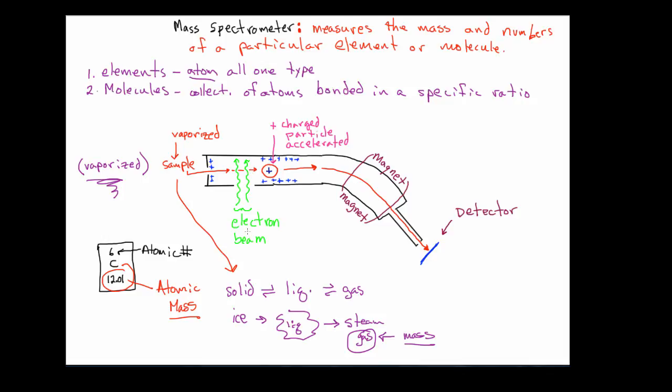All right, now this electron beam you can think of being basically a beam of atomic bullets. Now you imagine yourself walking down a hallway and you're going to pass by a doorway where somebody's got a 50mm machine gun shooting bullets directly across the hallway. And what's going to happen as you walk through that stream of bullets is you're going to be hit by some of them. And the situation is going to get really messy. You know, bits of flesh are going to come flying off you.